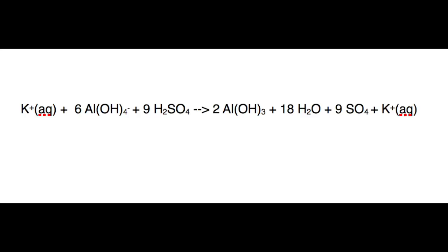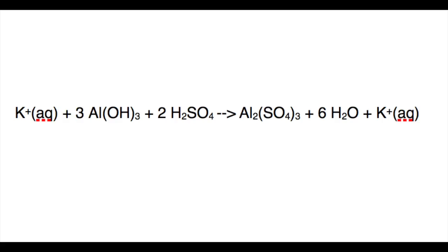Sulfuric acid was then slowly added to the aluminum-potassium hydroxide solution, and initially aluminum hydroxide precipitated outward. The solution was then heated and mixed using a hot plate and a new and clean stir bar. The aluminum hydroxide then dissolved back into solution as the solubility increased with the increased temperature, and the sulfuric acid neutralized the basic aluminum hydroxide solution.